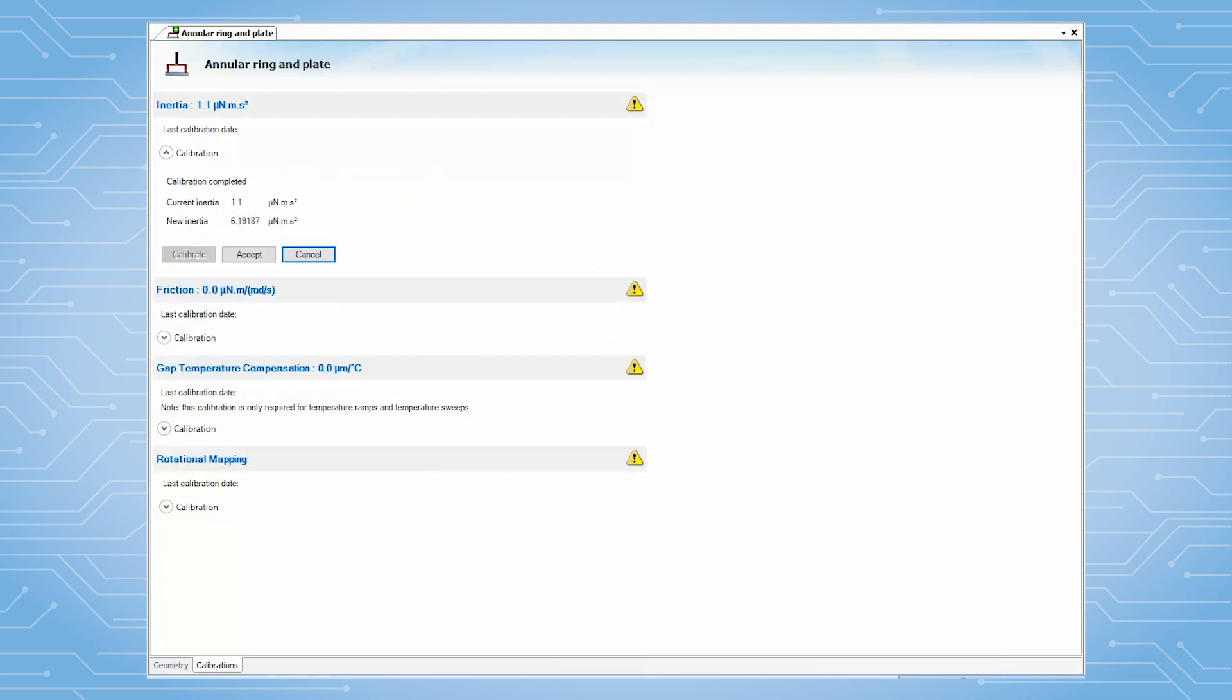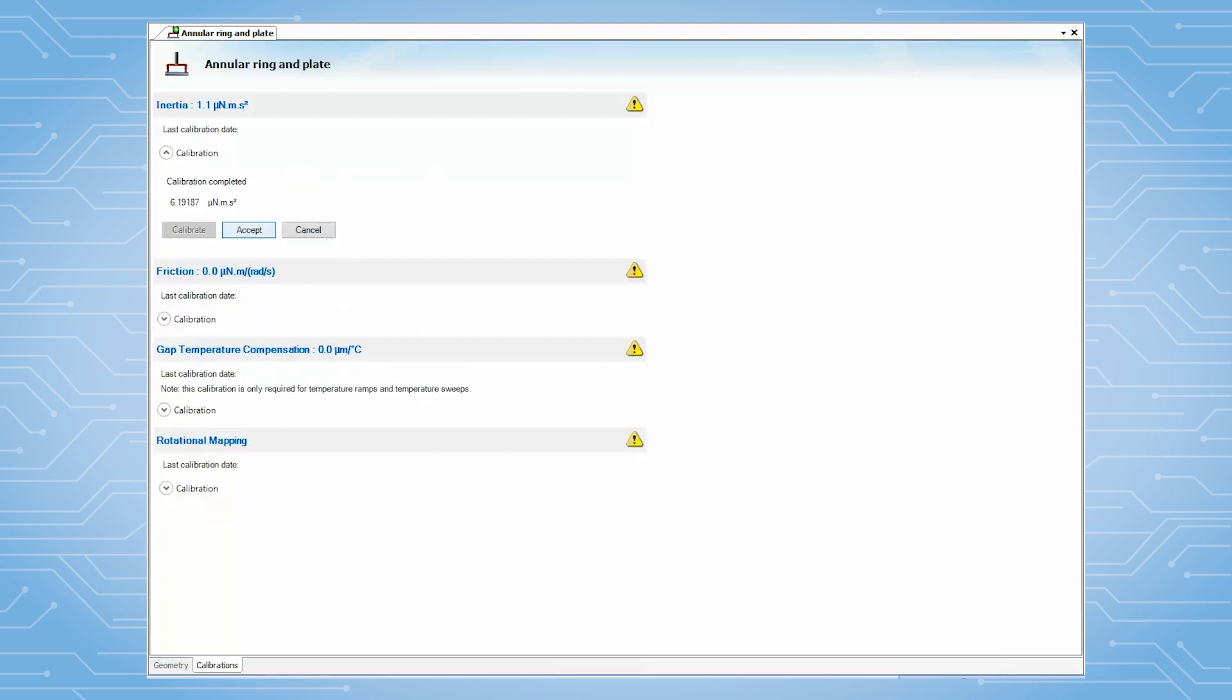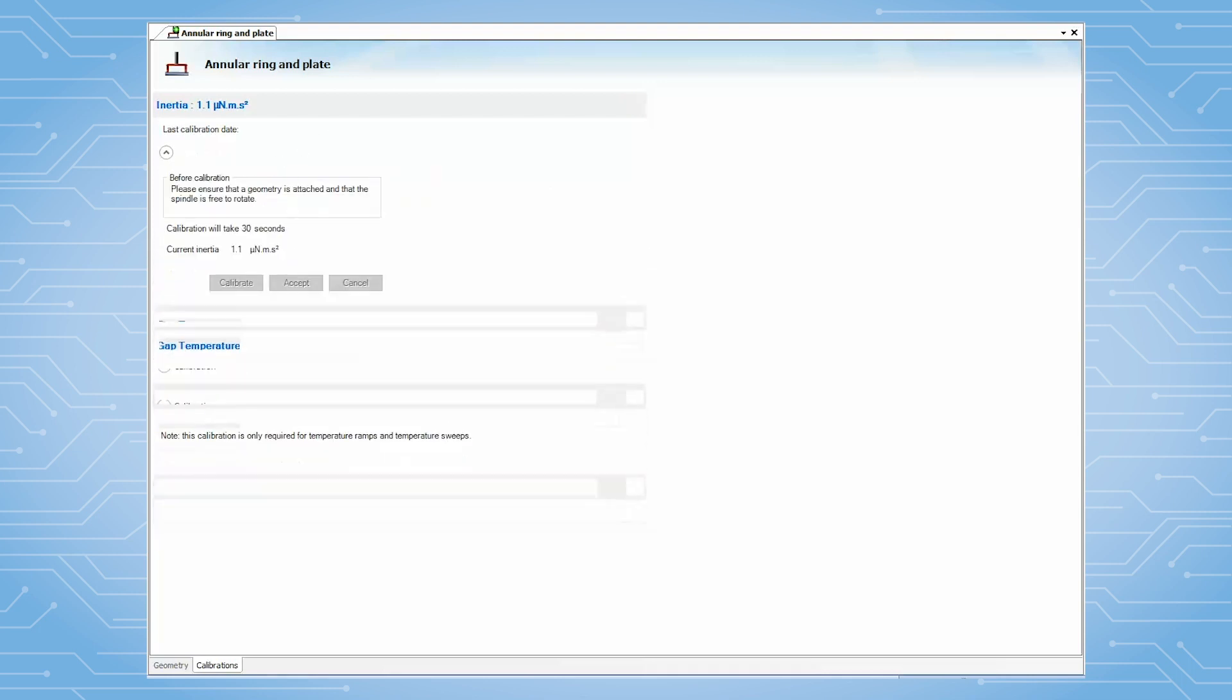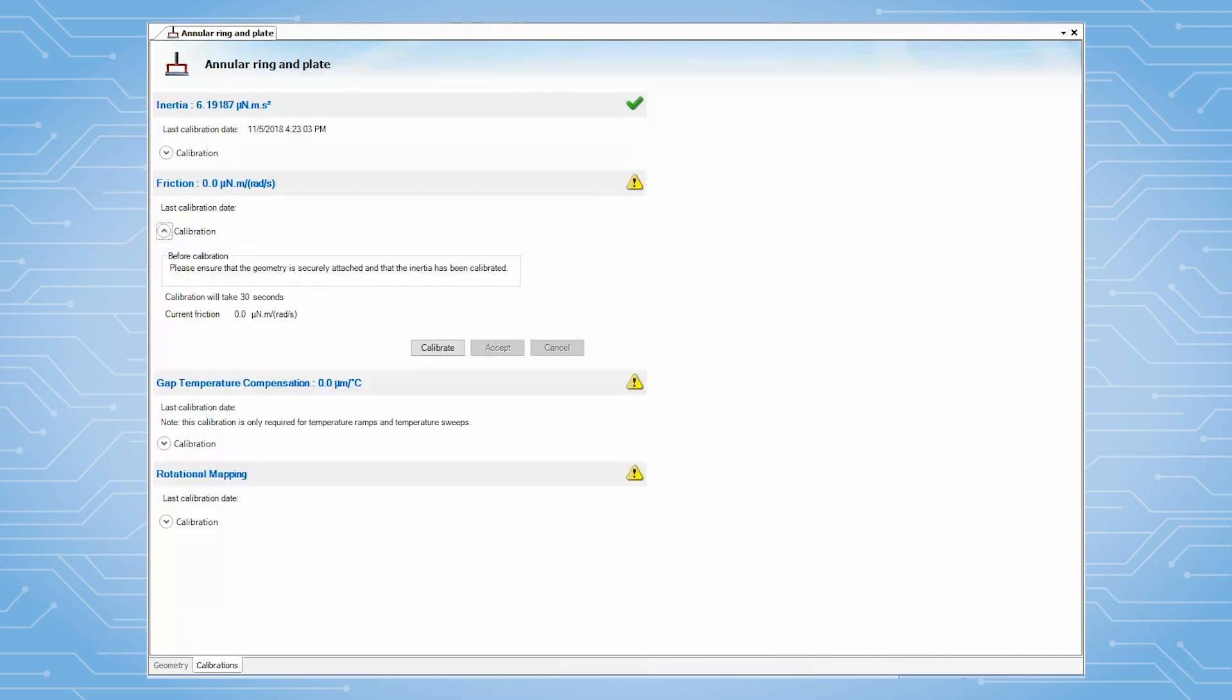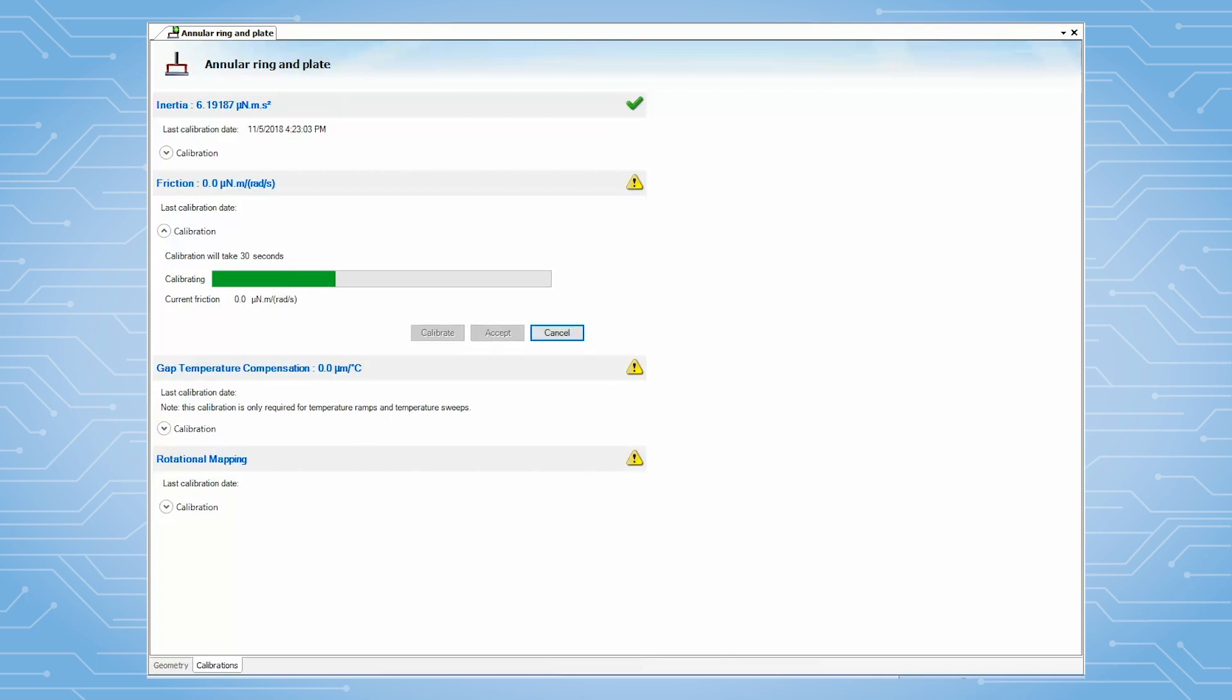Then, move on to the friction calibration. The friction calibration also takes about 30 seconds to complete. The residual friction value is usually between 0.2 to 0.3. After it is finished, click on Accept.